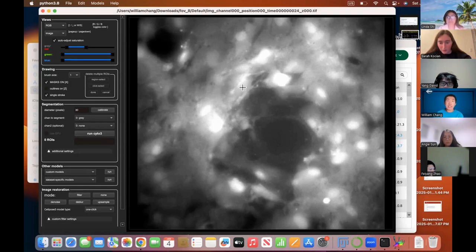What you want to do in Cellpose is train the model. The first thing you need to do with a practice set like this is identify the regions with cells. That's especially notable if you can see the bright outline here, for example.